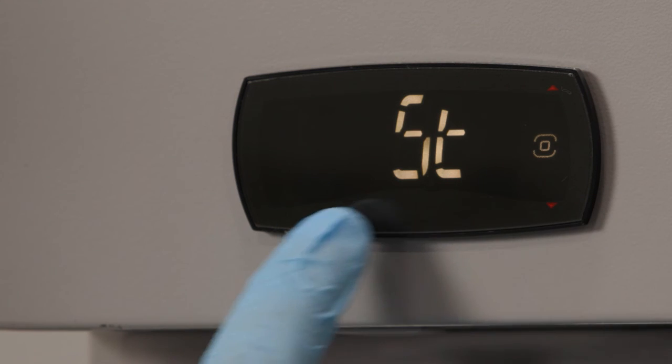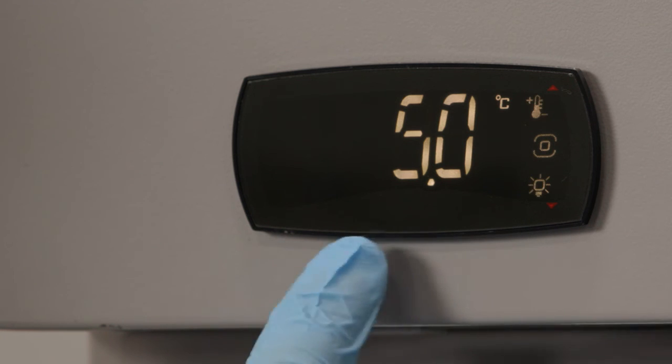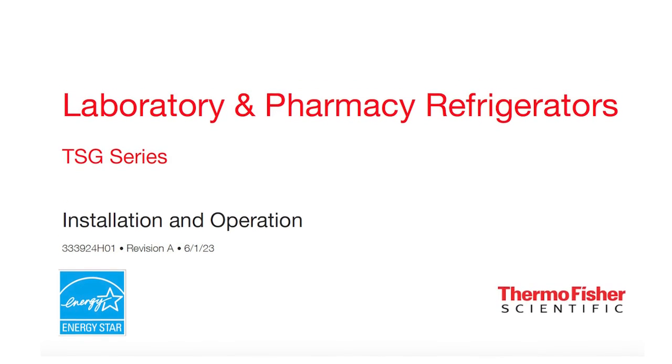View the Thermo Scientific TSG Series refrigerator setpoint reset video for instructions about changing the temperature setpoint. You can also refer to the Thermo Scientific TSG installation and operation manual for additional information.